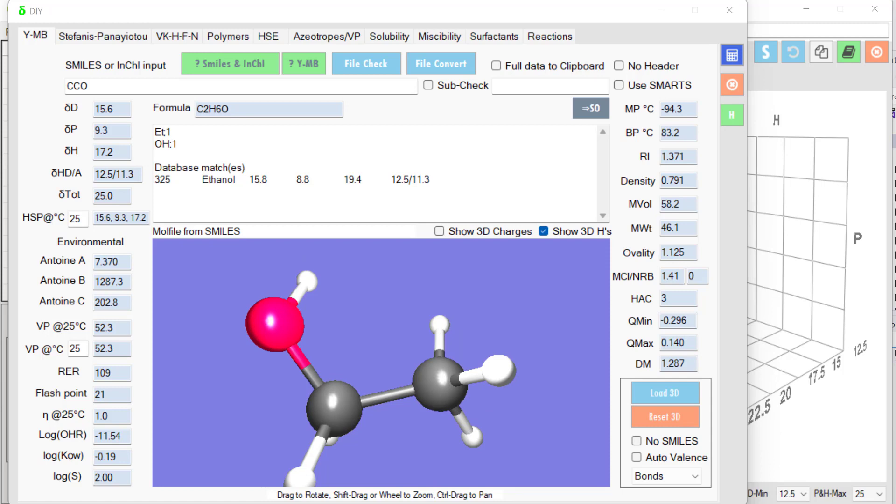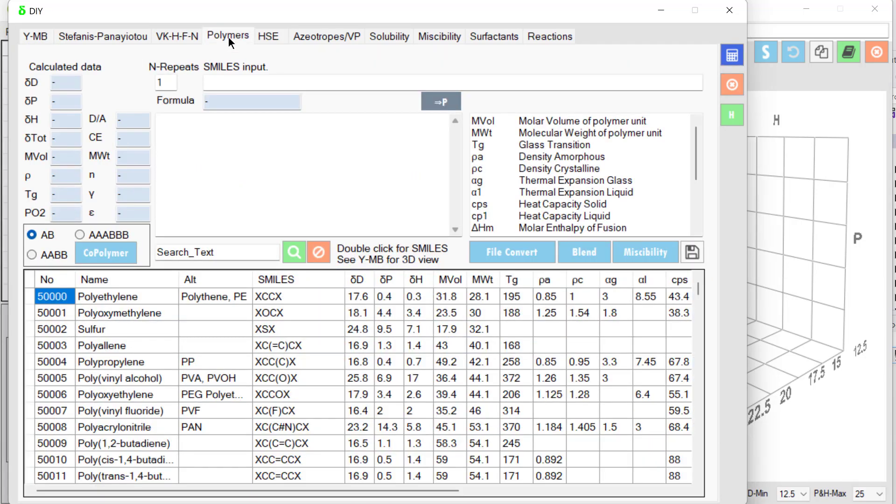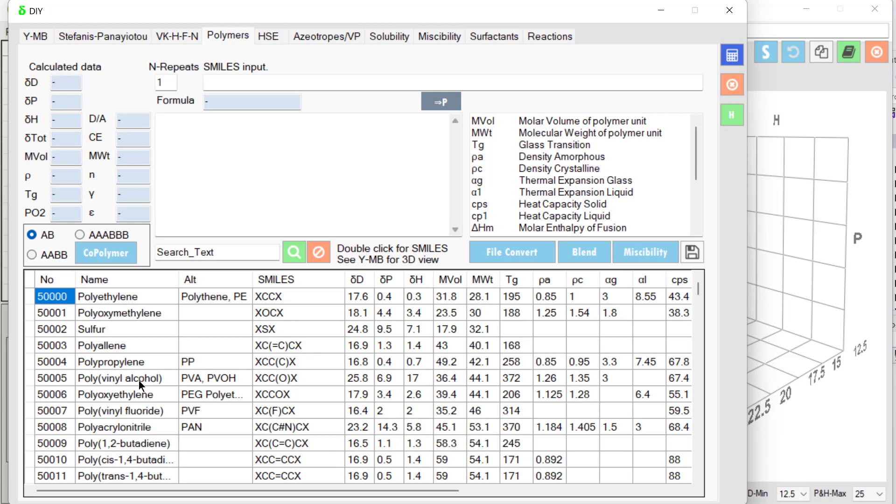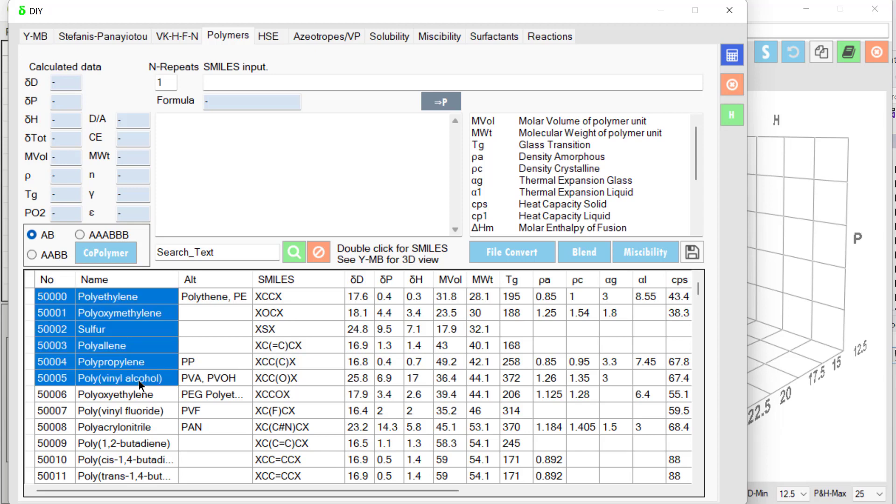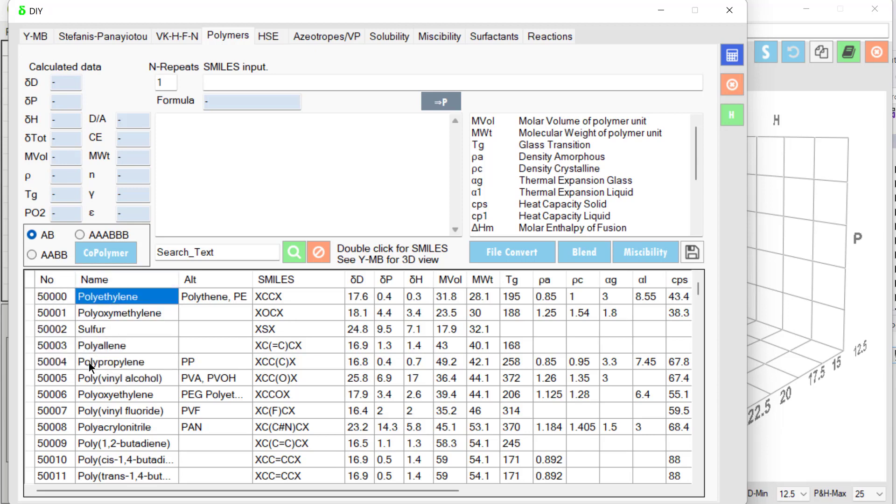We can do more than just estimate HSPs of molecules. We can do it with polymers. Polymers are represented by polymer SMILES where the X shows where the units are connected. So polyethylene is just carbon-carbon joined in chains via these Xs. Let's say we wanted a copolymer of polyethylene and polyvinyl alcohol to make EVOH.